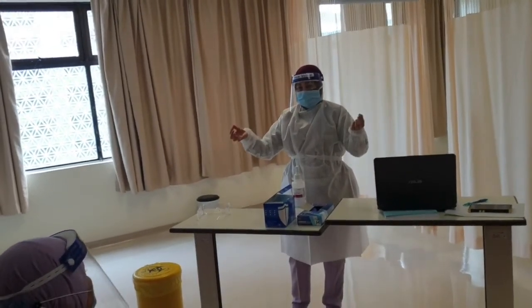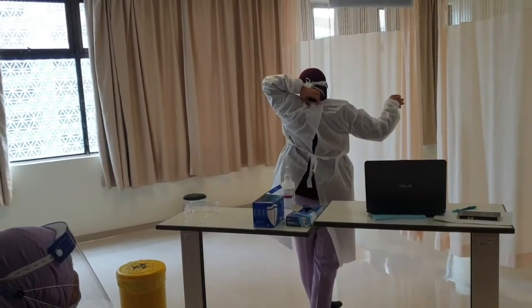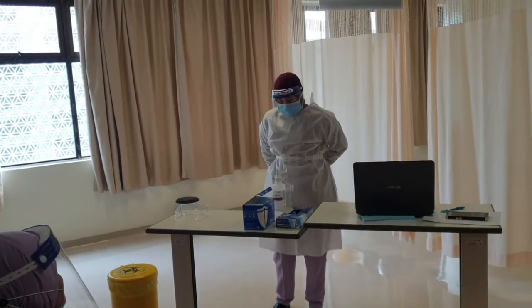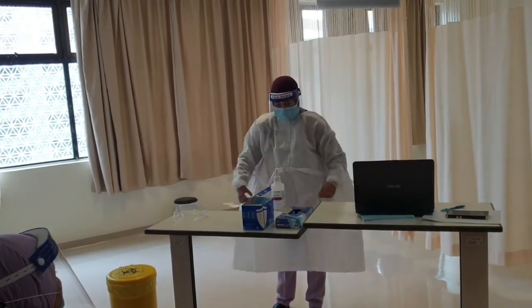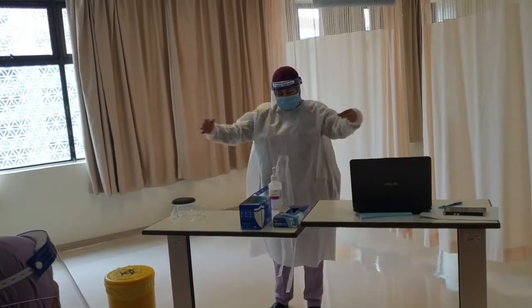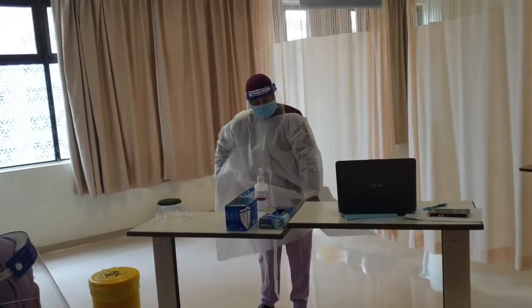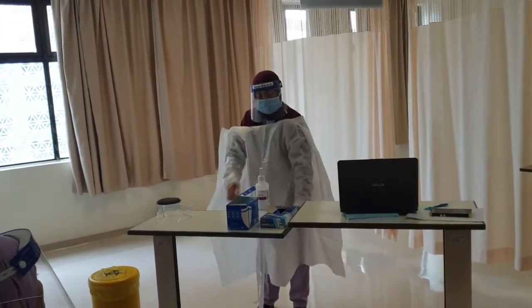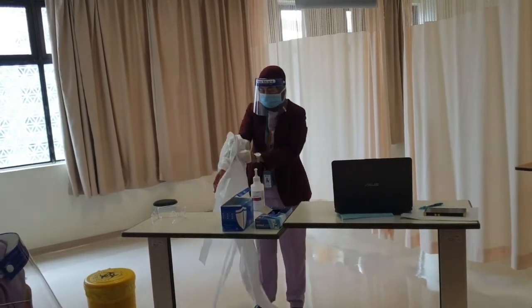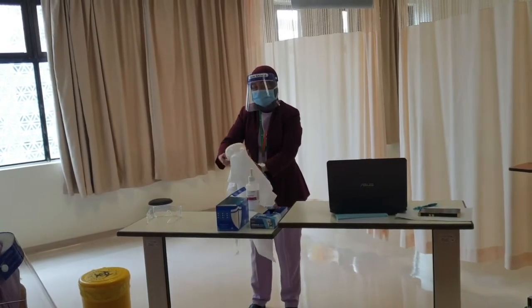How do you remove the gown? You just peel it out. This part, don't touch. Make sure the front is not touched. So you pull, you roll.